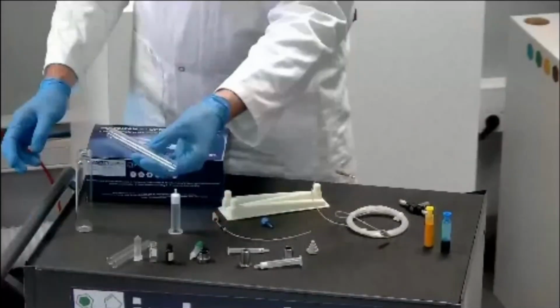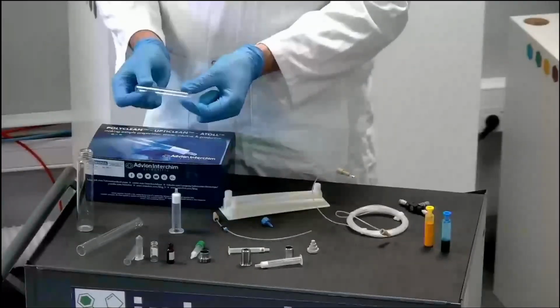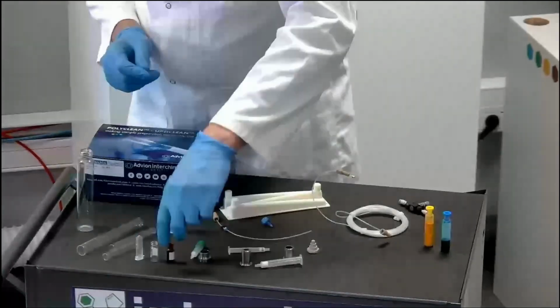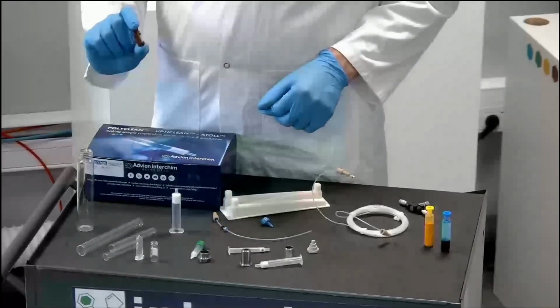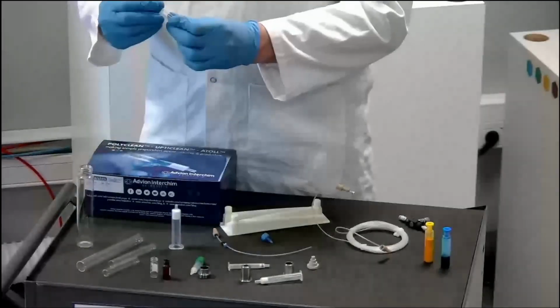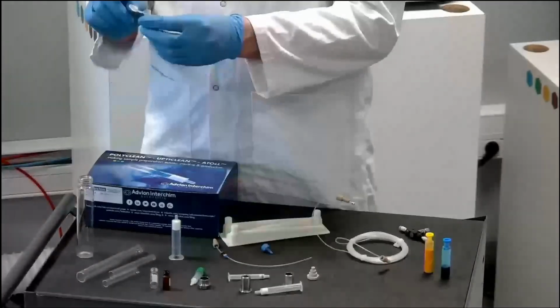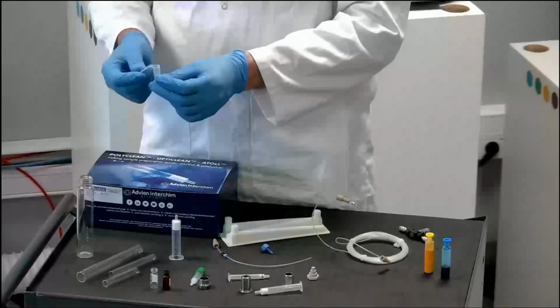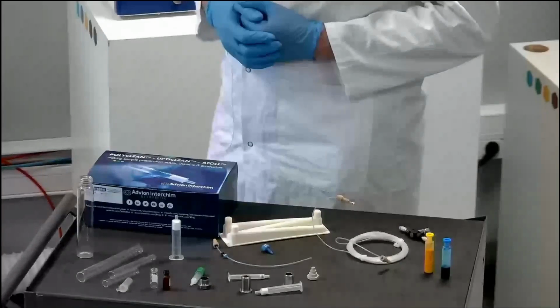We have test tubes. The main test tubes that you can use sometimes for some preparation are 13 or 16 millimeters for the external diameters. And we have the possibility to use small vials. With the small vials, you can collect up to 5 vials per sample, especially to control your purification. Another size that you can use is Eppendorf tubes, so centrifuge tubes. Even if you have the caps, you have the possibility to put the centrifuge tubes inside your collection rack. So different possibilities to collect your fraction according to your methods.